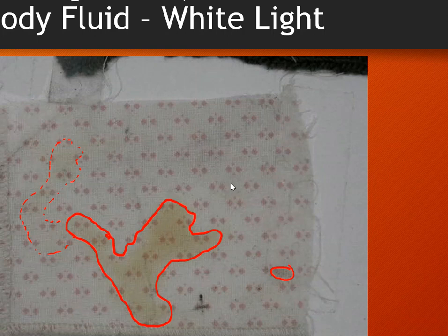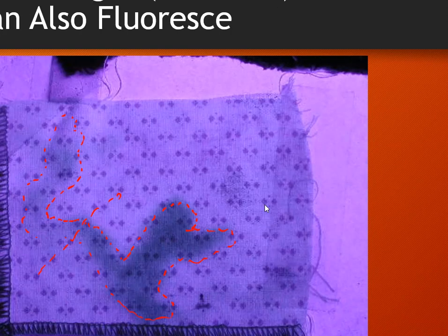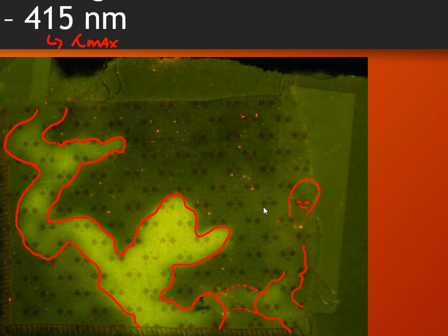That way I can take this piece of fabric to another part of the laboratory and say, please swab these areas, tell us for sure if this is blood or not, or tell us if this is semen. And if it is semen or blood, I can then extract DNA from those areas and run those DNA samples and maybe help identify a suspect or a killer or a rapist, somebody, right?